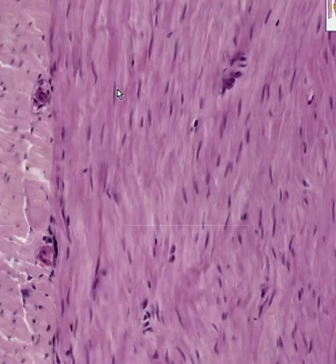If you are looking at smooth muscle fibers which have been cut transverse to their longitudinal axis, they'll look like they're round. If you cut them longitudinal to their longitudinal axis, they will look like little cigars or very, very spindly. Quite frankly, you could have a very hard time differentiating this from a connective tissue, perhaps dense, regular, or irregular connective tissue.